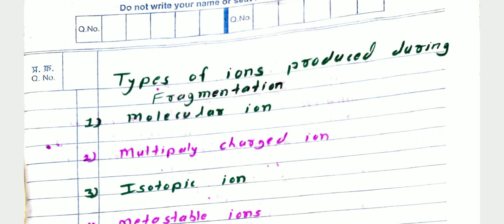Ionization of the analyte forms a large number and types of ions having a characteristic m/e ratio, meaning mass to charge ratio. Their relative abundance varies with the type of analyte and the ionization conditions used. There are 13 types of ions produced in the ionization chamber, but only cations are analyzed.